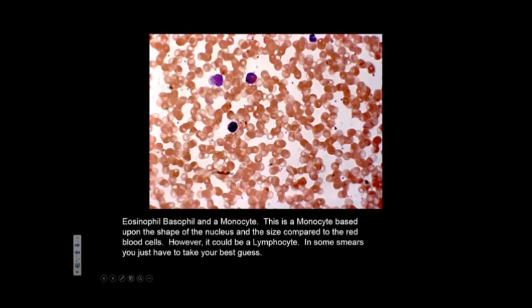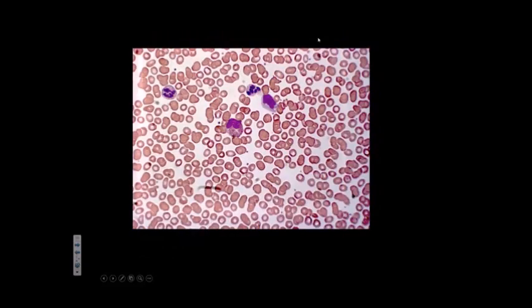And I don't know what that is. It's a booger of a cell. I would guess, I don't know. It's just wrong. So this is a really good example. So we got, what cell type is this? Neutrophil. Speak up. You can make mistakes here. So what cell type is this? Probably another neutrophil. So what cell type is that?